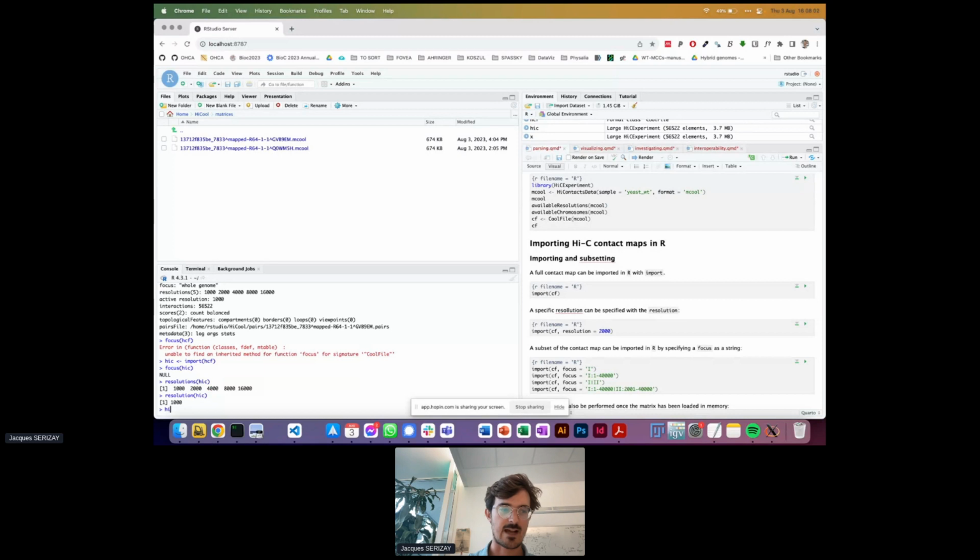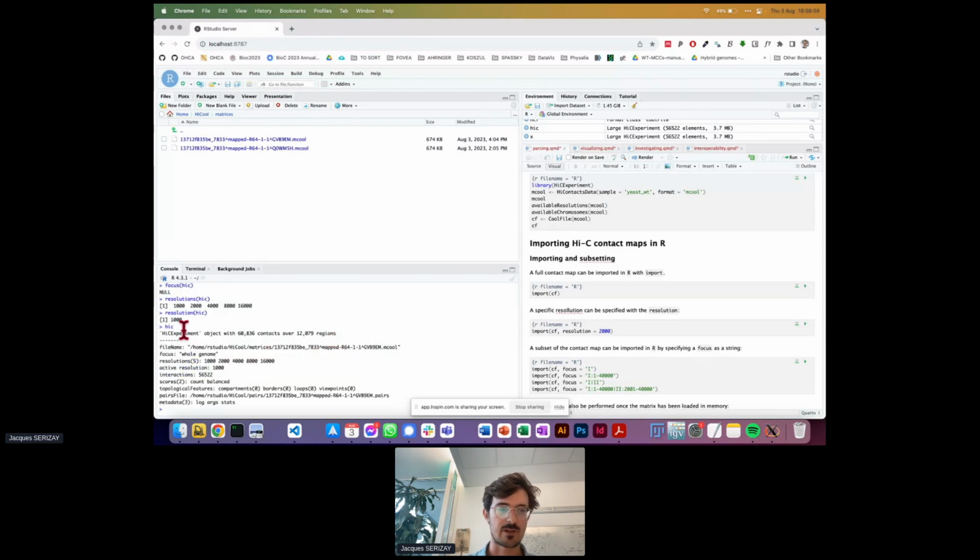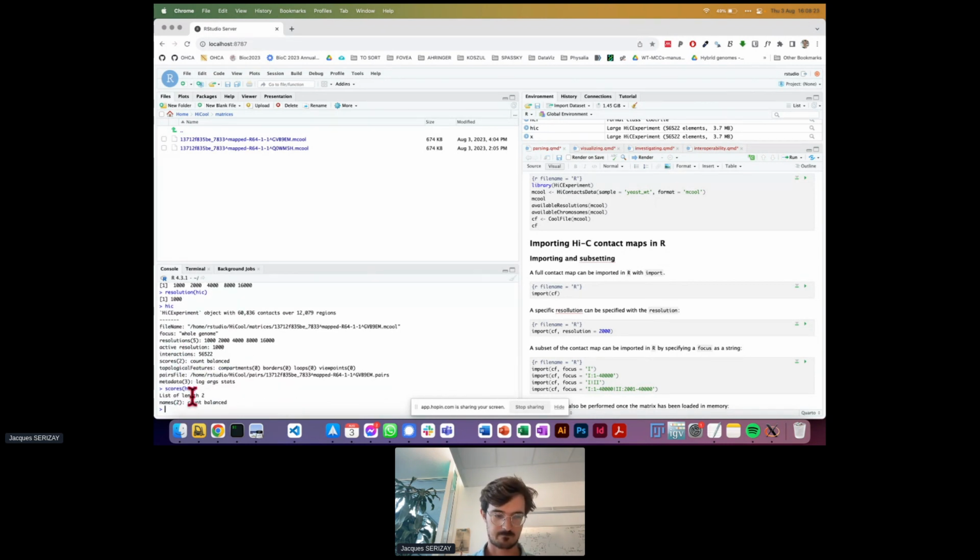Okay, and all of this is actually quite visible when you print the summary of the HiC data. So now the actual data contained in the HiCExperiment object is located here. Interactions and scores, and one can simply access them using the getter function scores.